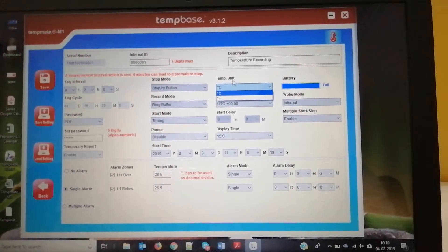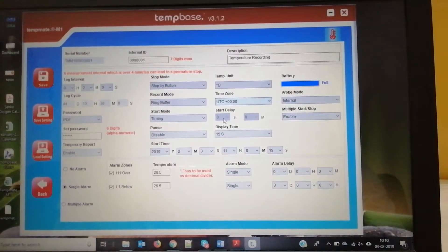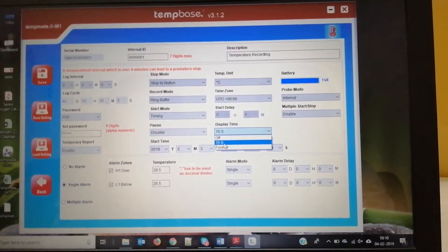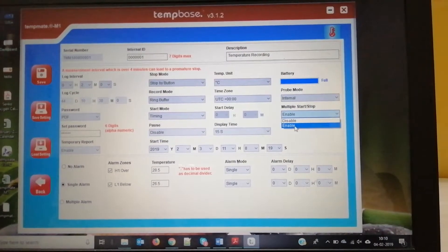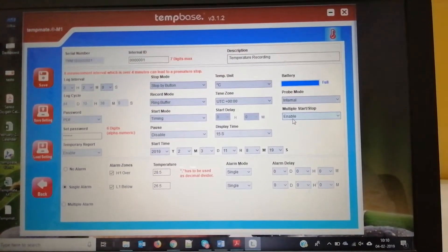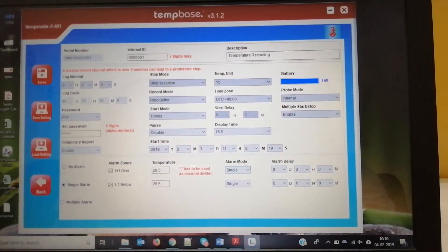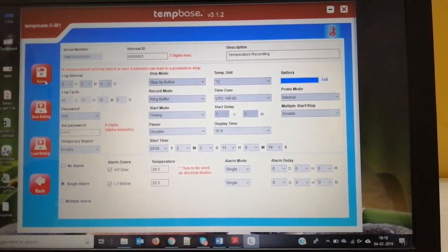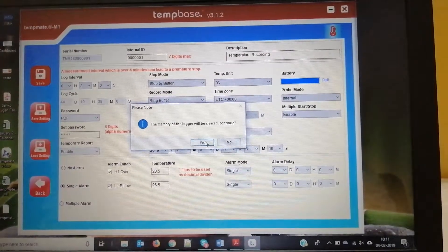This is the temperature unit — you can choose to record in degrees Celsius or Fahrenheit. You can set the time zone based on your location, and the display time can be set to forever in the software. Multiple start or stop allows you to stop the data logger after a particular period and restart it after, say, five minutes. You have to save whenever you set new parameters, as the previous data will be erased.